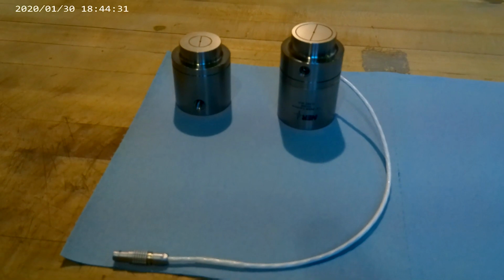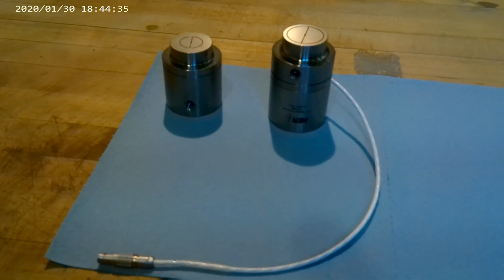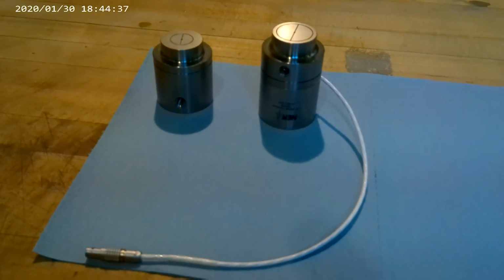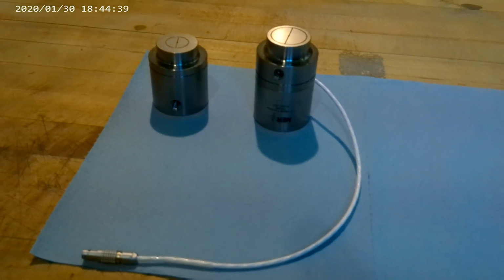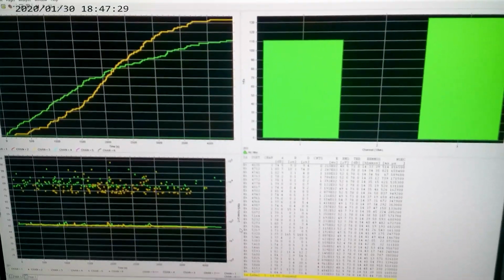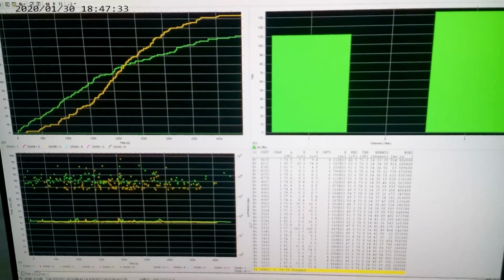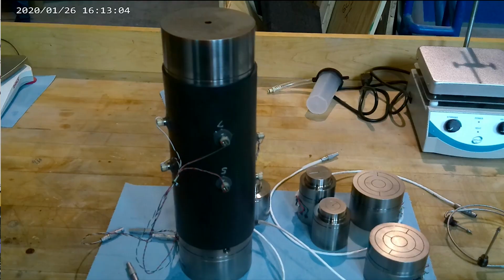A flow apparatus and acoustic emission for multi-phase fluid flow analysis are based on theoretical methods to quantify steady state and low permeabilities. Acoustic emission sources emit transient elastic waves that propagate through the test specimen and transform into surface waves at the specimen surface. These surface waves cause surface displacement that is converted into an electrical signal by the sensor. There are 8 channel sensors on the surface of the specimen.